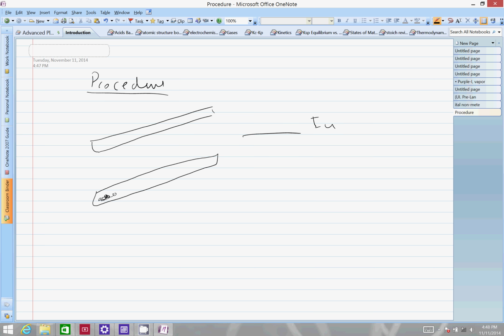I would pull it pretty good, and we'll use tongs to grab onto this thing. Not very good tongs. Okay, but grab on this thing because we don't want to heat or hurt our fingers, I guess. A little flame. And as the heat arises, it quickly vaporizes the iodine, sublimates it. It may go to a liquid for a very short period of time, but you can take a look.